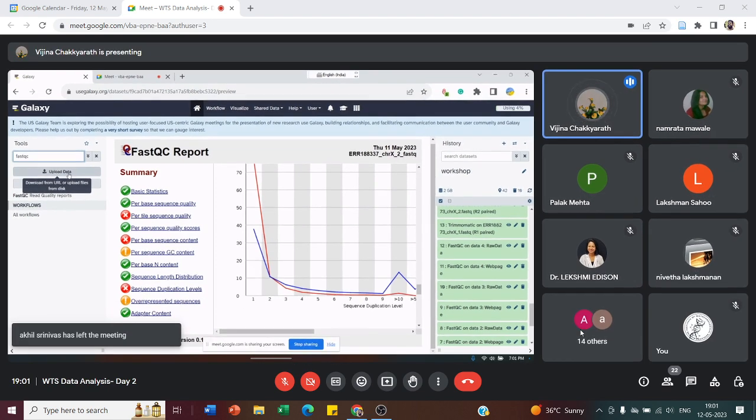It can handle different types of sequencing data, including Illumina paired-end and single-end data. It also offers options like trimming by quality, removing adapters and contaminants, and removing reads that are too short or too long.